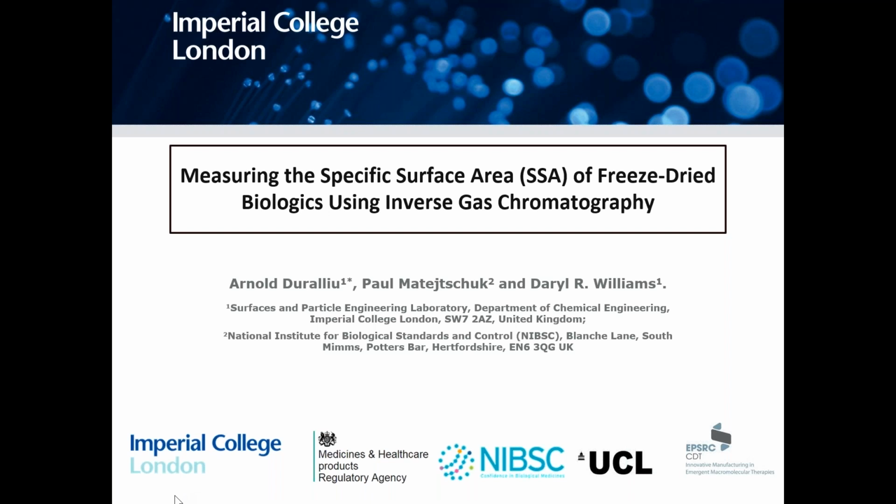The last presentation today is another project from Arnold's PhD, who worked on biological materials, particularly freeze-dried materials. When it comes to a topic I introduced a bit earlier today, there are lots of pharmaceutical and biopharmaceutical materials where you really want to know what their surface area is. Although traditionally you might think about doing nitrogen adsorption, the truth is, for probably a majority of biopharmaceutical and certainly a lot of pharmaceuticals, the nitrogen BET method is just not accurate or sensitive enough to do a very good job. Freeze-dried materials are a particular example. As we'll see today, they have low surface areas, and doing them with nitrogen is quite challenging.